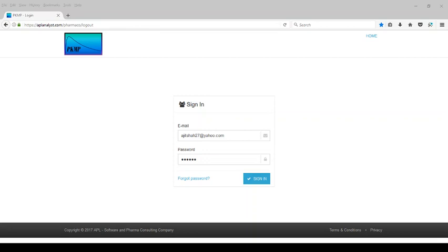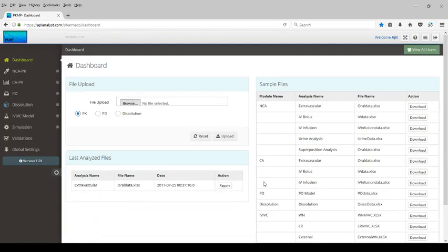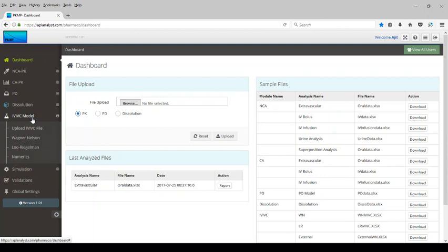The first thing that we need to do is to sign into the program using your credentials. Once you click on sign in, you are into the program and we need to click on the IVIVC module where you can upload the file needed for the data analysis.